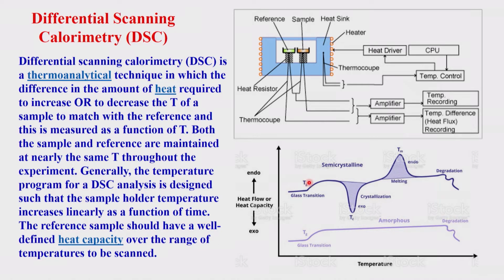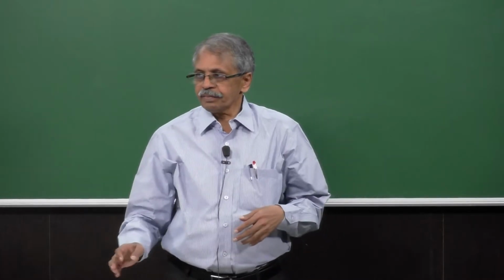We have already explained to you earlier in the previous class, going from the solid-like to the liquid-like kind of situation, and crystalline or semi-crystalline. Or from one crystalline to another crystalline. These kinds of things, and then melting. Melting is of course there, and then if you go further beyond, you may have some kind of reaction or a degradation happening, any of these.